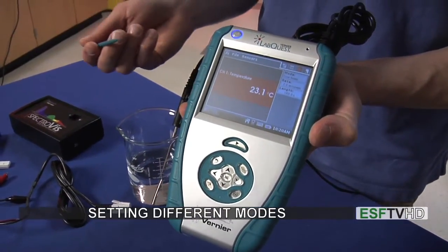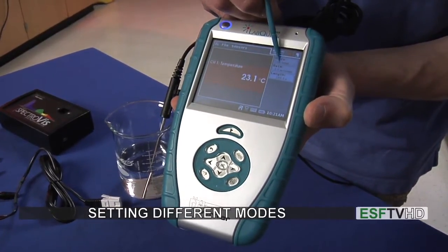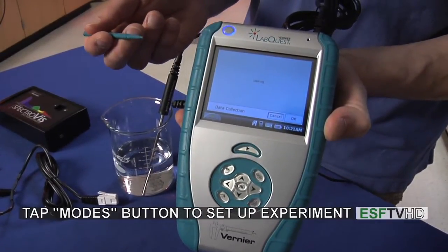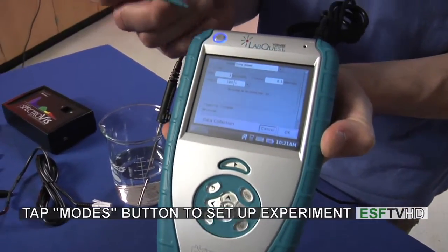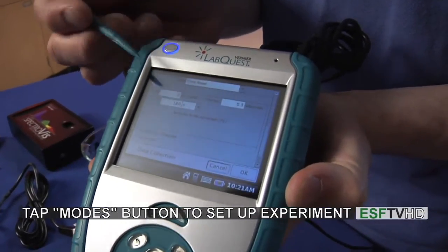Now if I want to set up an experiment in a certain way I can change the mode, and that's where I tap on the screen over in the mode section. I'll then get a dialog box. That dialog box is going to allow me to change the rate of sampling. Right now it's going to take two samples for every one second, and it's going to collect data for a total of 180 seconds.